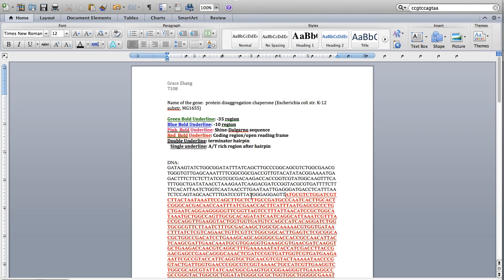Okay, so if this is my actual start codon, now let's see if I can find a Shine-Dalgarno sequence. So looking down, I see a GGGAGG. Oh, but I also see an AGT here. Okay, and then before and after, there's only this 1 nucleotide difference for each. So this is kind of a crapshoot. I think for this purpose, I'm going to actually go with the GGGAGG as my Shine-Dalgarno because it gives me a little bit more of a gap between my start codon. So I'm going to pick this one.